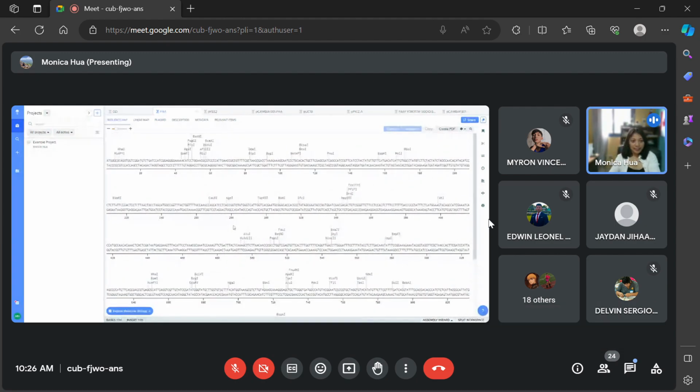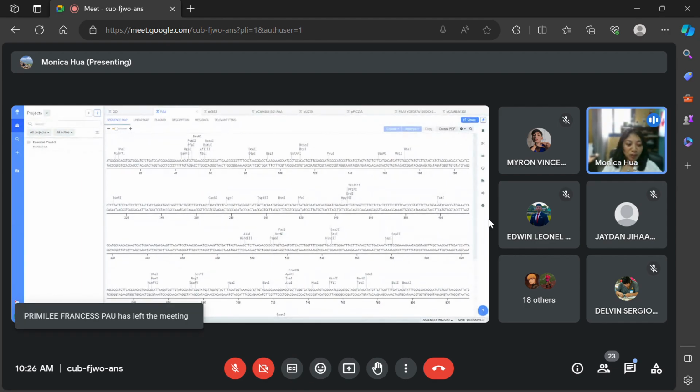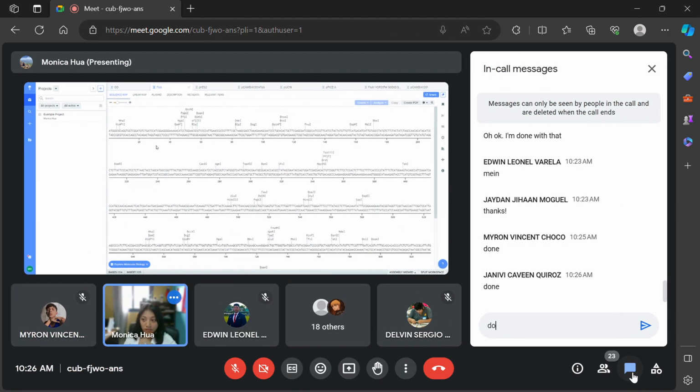All right, guys. We need to be on the same page right now, because this is going to be a little bit confusing. So please, everybody, please type done when you're done.